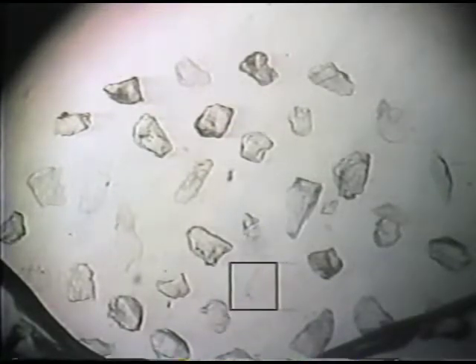Now, these grains that showed the relatively low relief are much more likely to be good grains in which to find E. So we would select some of these grains and use them to see if they show the right kind of interference figure.